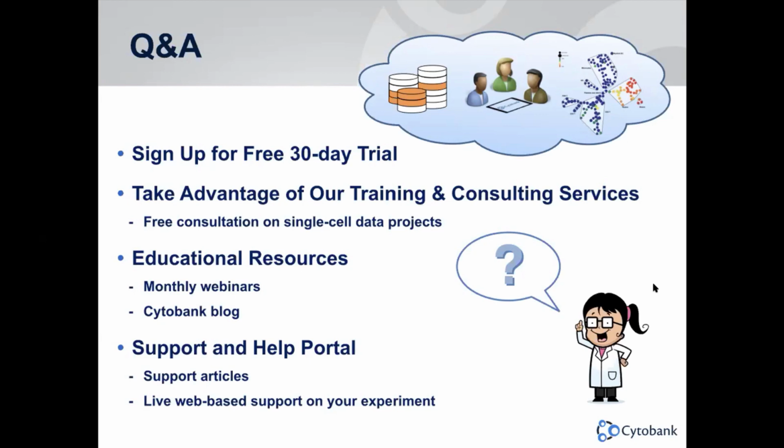So I want to see, have you followed up on the significant difference that was identified by SAM, but not the PAM? Did you do any manual verification or any other models to identify if they are significant?